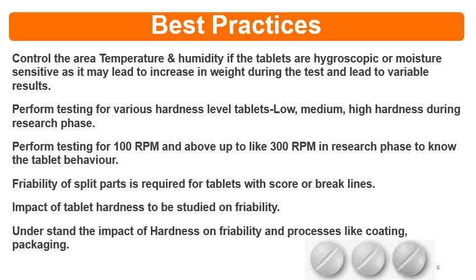Instead of weight loss, the weight is increasing. That means there is weight gain. If this happens, either there is a problem in the initial weighing, or your balance is not calibrated, or there is some issue in the weighing. Another reason may be moisture pickup or moisture absorption by the tablets, or an increase in weight due to higher humidity. So you have to control the area temperature and humidity while you are testing the tablets.